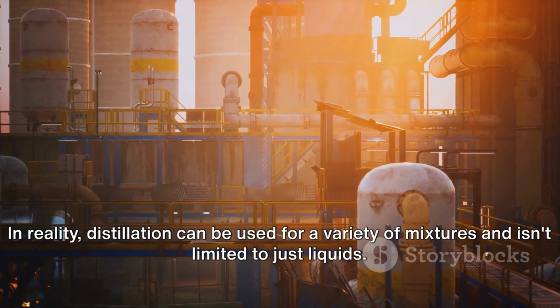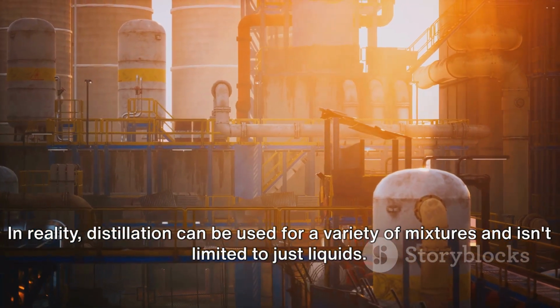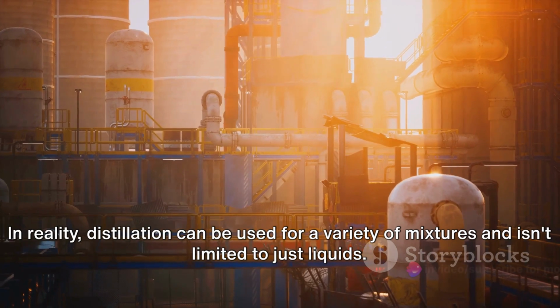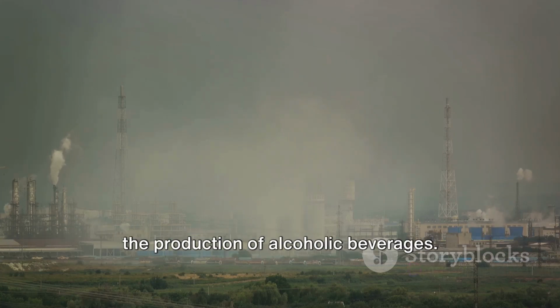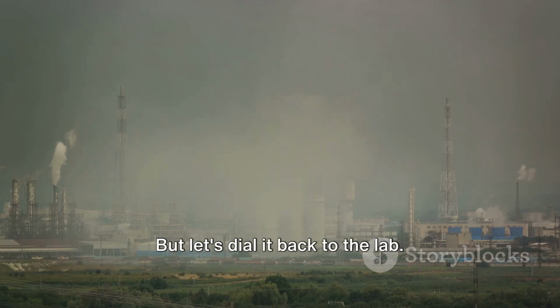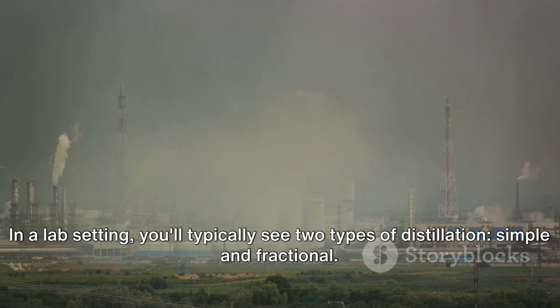In reality, distillation can be used for a variety of mixtures and isn't limited to just liquids. It's a versatile technique that's widely used in industries like petroleum refining, food processing, and even in the production of alcoholic beverages. But let's dial it back to the lab.